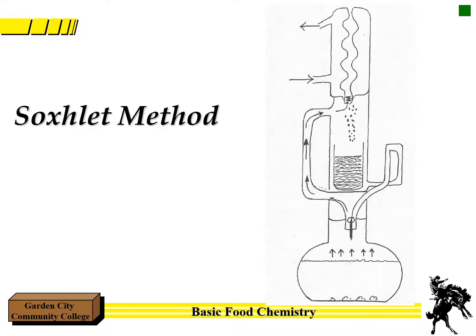So again, going back to the wet and dry sampling, it depends on whether the sample is dry or not. So for example, when you're doing a dry sample, like meat or a feed sample or something like that, you go through and remove all the moisture first, so you have a dry sample, and then you would put that in these little capsules. Typically it looks like a tinfoil little capsule, and you basically fold it all up so that nothing escapes.